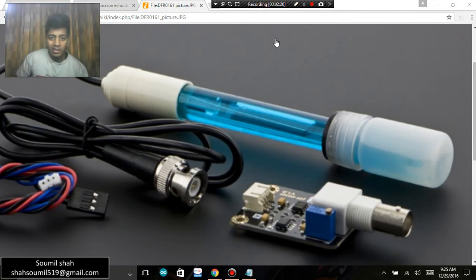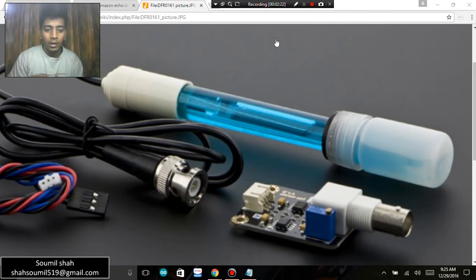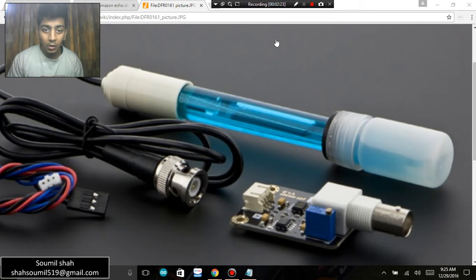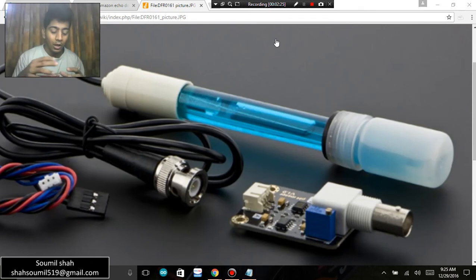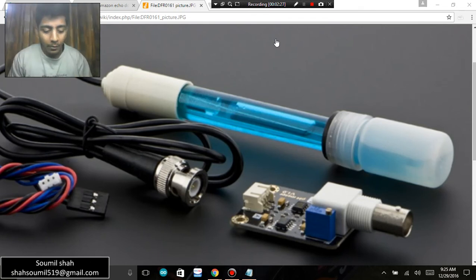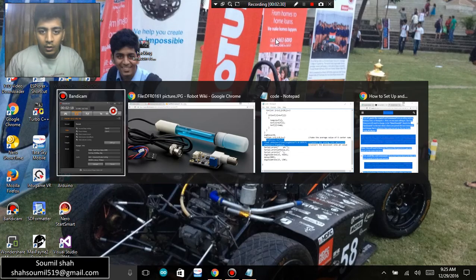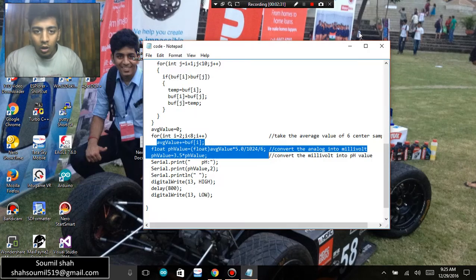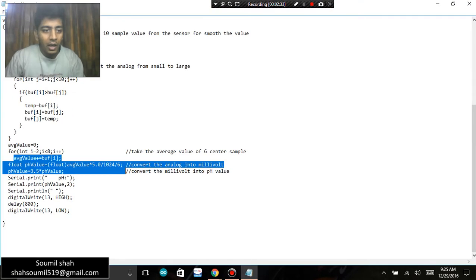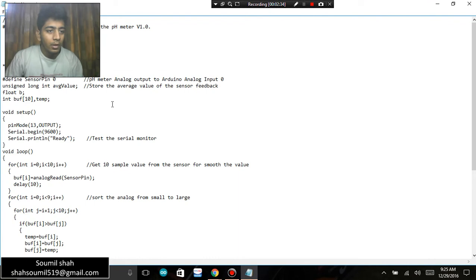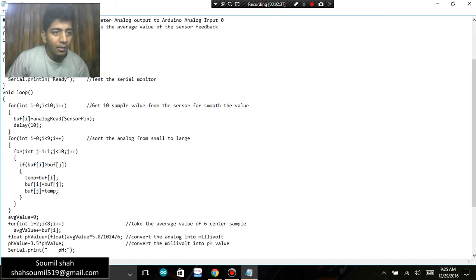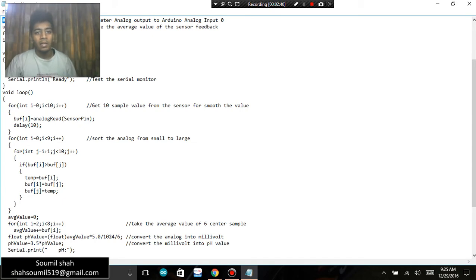Let's jump into the coding part. What is the code, how to write the code and stuff. Alright, so here we have the program itself. First of all I'm defining a sensor pin as zero, that means I'm attaching the sensor output pin at analog A0 of Arduino microcontroller.